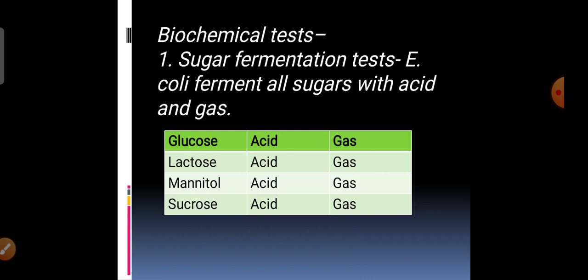If the organism is E. coli, it ferments all the sugars with both acid and gas. When acid is produced, the color of the indicator changes, and if gas is produced, it gets collected in the Durham's tube. For example, if you use bromothymol blue indicator, it is green initially because the pH is neutral 7. When the organism ferments lactose or glucose, acids are produced, pH changes towards acidic side, and the color changes from green to yellow. Gas production can be checked in the Durham's tube.